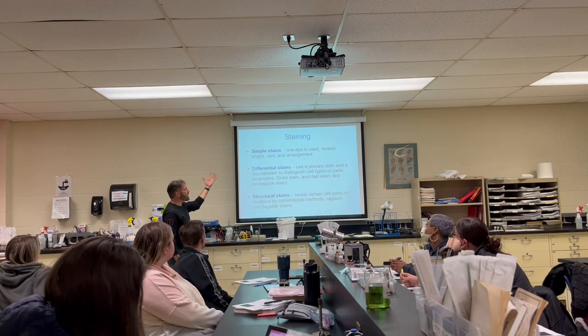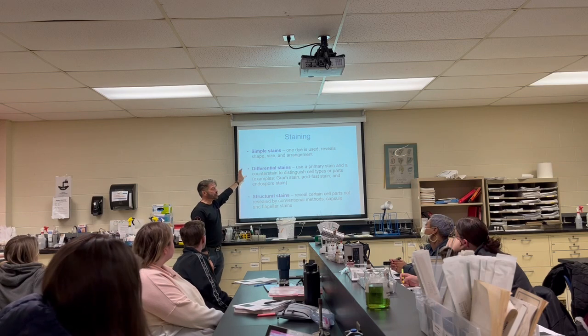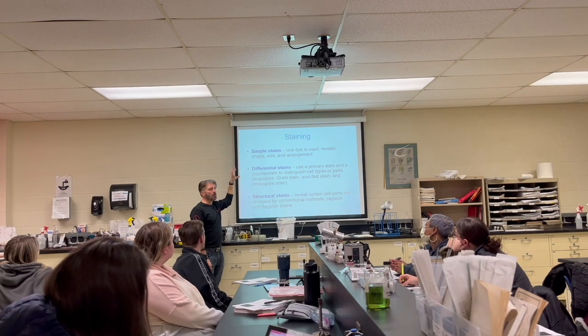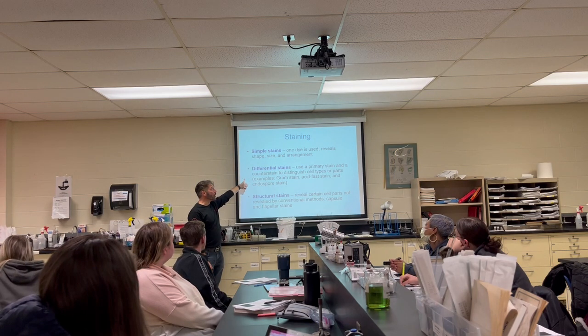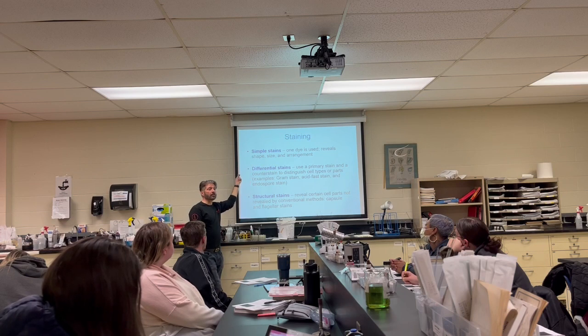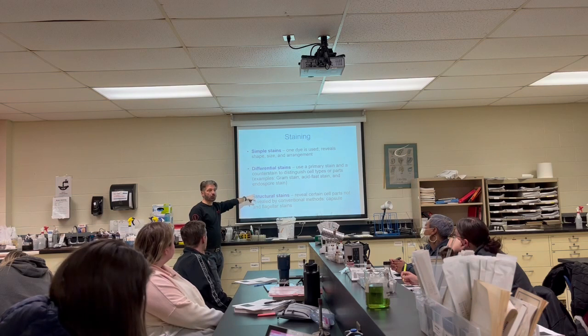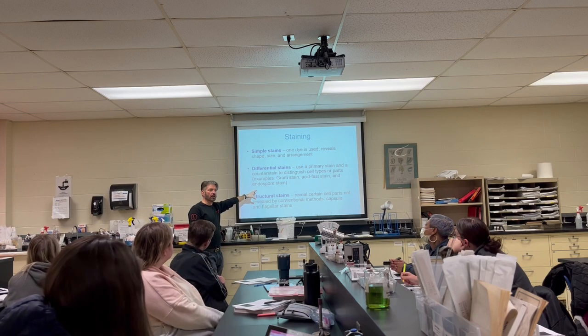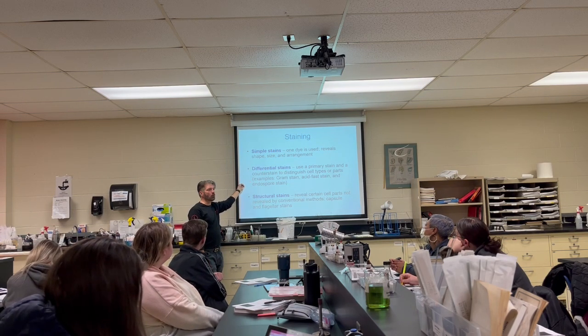Now, we're also going to be using differential stains. That means I can differentiate between certain bacteria. A little bit more complicated, but a lot more information. If I want to diagnose something or figure out how to treat it, I want to know whether it's gram positive or gram negative, acid fast, or has endospores. Last week, I talked about Lysol, and I said it kills 99.9% of everything, but what's left? Endospores. So if you were treating an infection and you knew that it had spores, would you agree that it might be more difficult to treat?